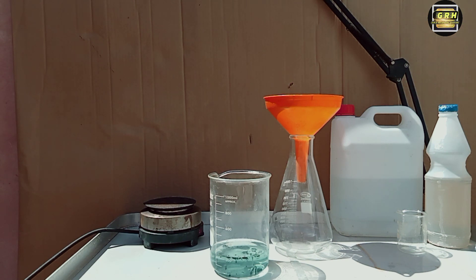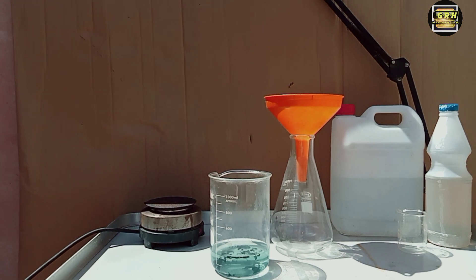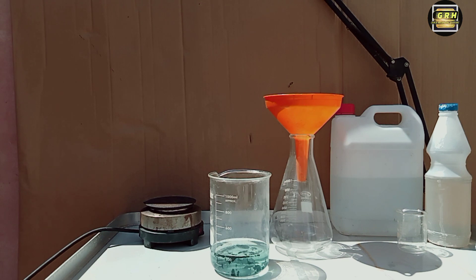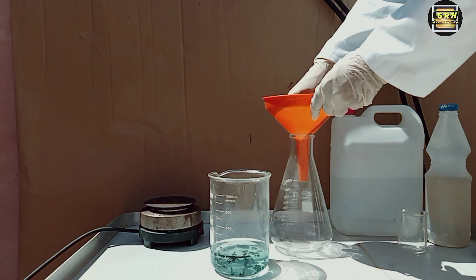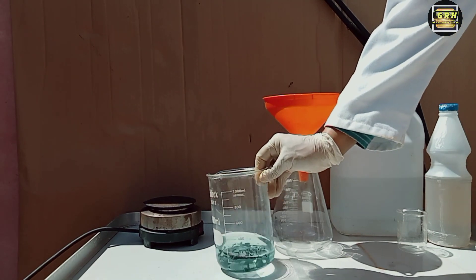You will see a green solution — let it sit to cool. Fish out any particles that did not dissolve, then filter the solution to remove any remaining solid.